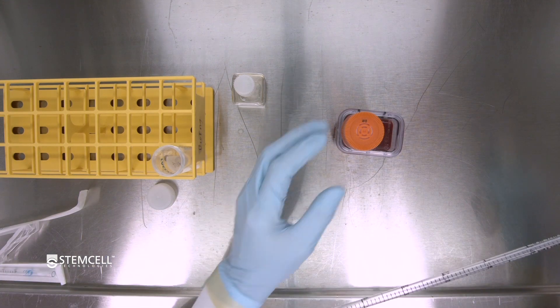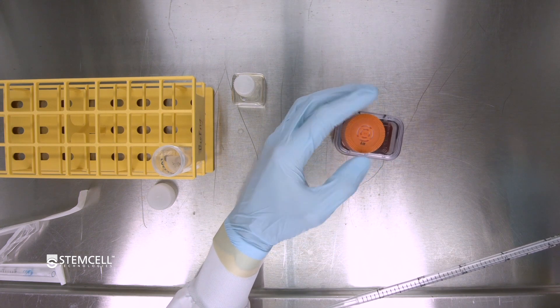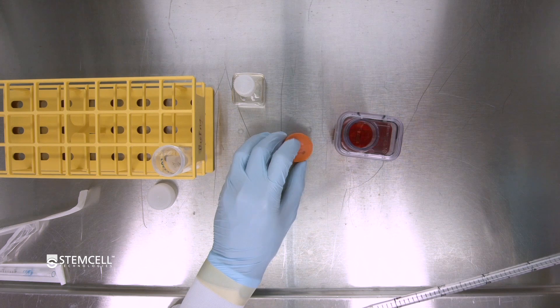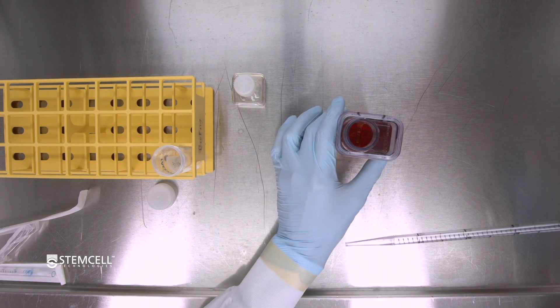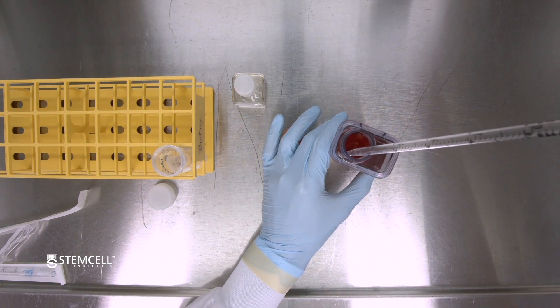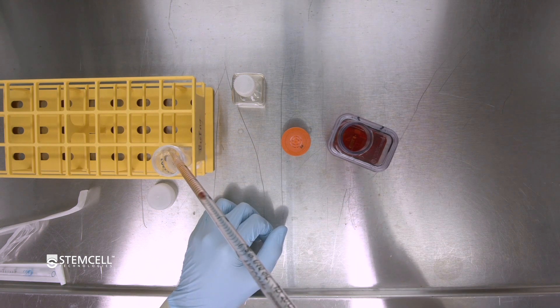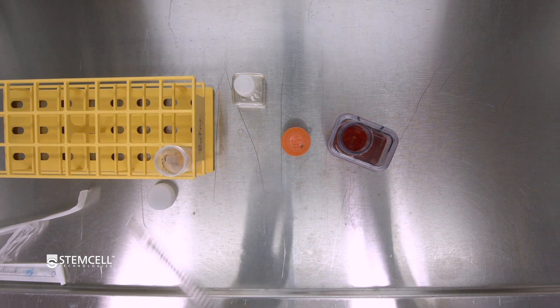Working sterilely, remove the lid of the bioreactor and place the lid face down. Aspirate an amount of spent media equal to the amount of media to be added. Since we are feeding a volume of 3ml, we will remove 3ml of spent media from the culture. Discard the spent media in a 50ml Falcon tube.